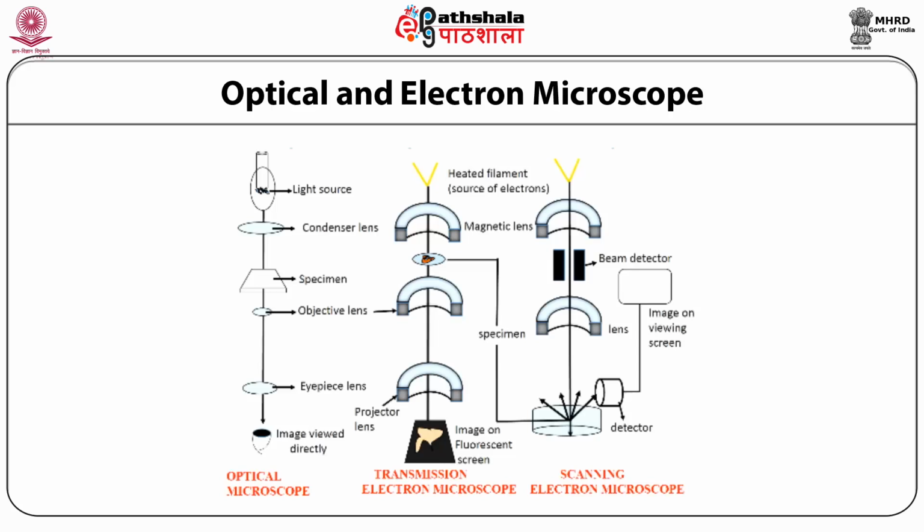The wavelength of an electron is thousands of times shorter than visible light, enabling electron microscopes to resolve this issue and provide better magnification to image objects at very low dimensions. Hence, electron microscopes can be used to visualize inorganic, metallic, organic and biomolecular entities at atomic scale resolution.